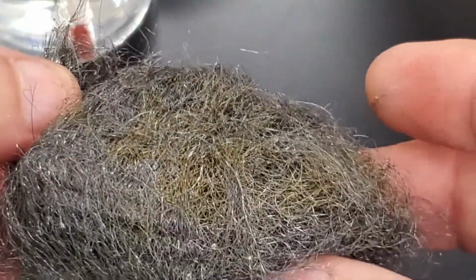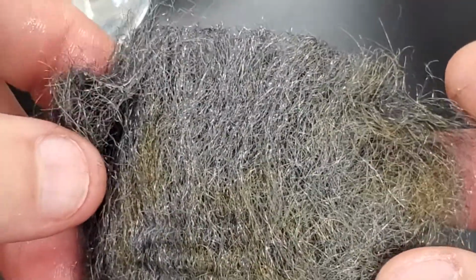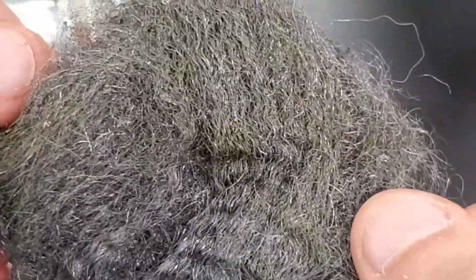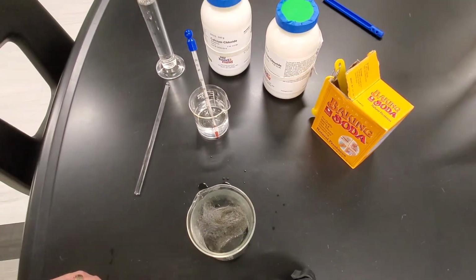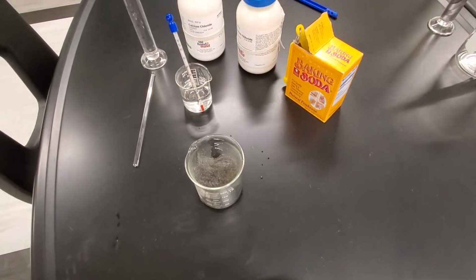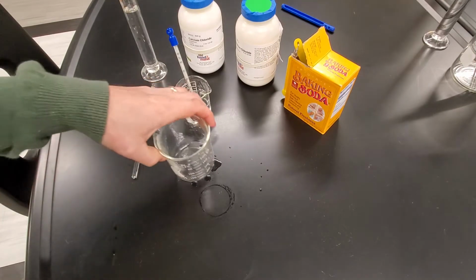Do you happen to see any changes that might have occurred? If you do, you can write that onto table 1 under your observations. All right, so at this time, I'm going to rinse out my beaker and reset for the next combination of chemicals, and then we will repeat the process. All right, so I have it cleaned out.